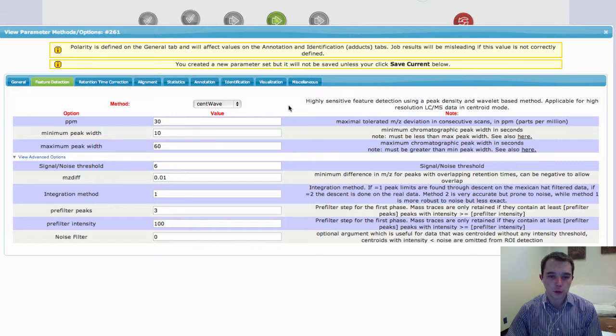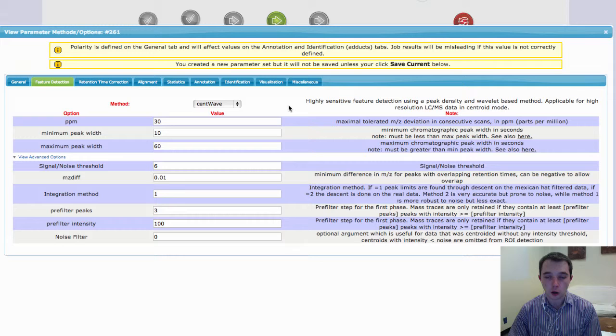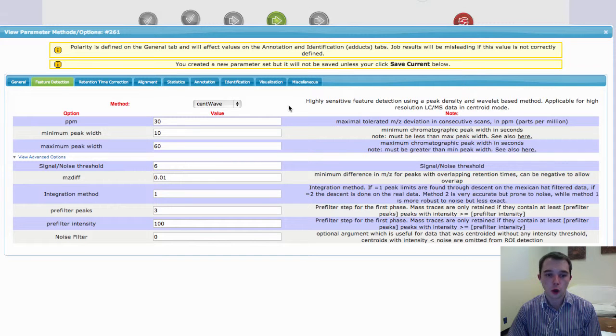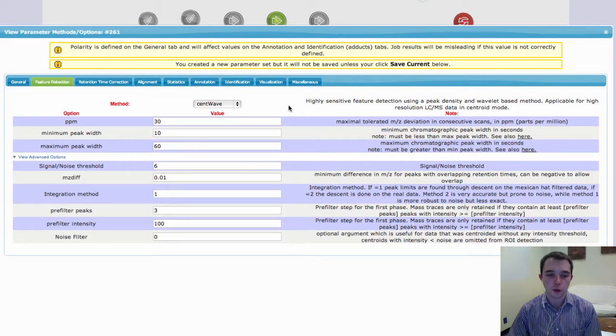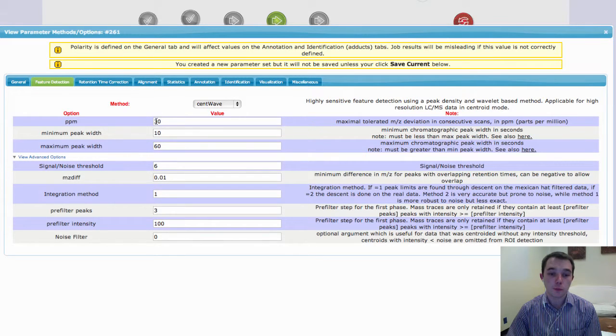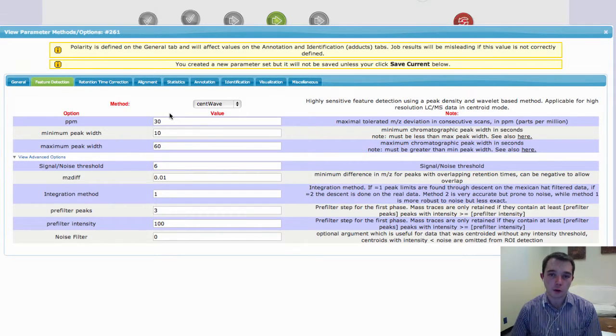Now, in CentWave you have three main options that you need to think about, or two in some ways, depending on how you look at it. One is this PPM value, and this is how accurate your instrument is.